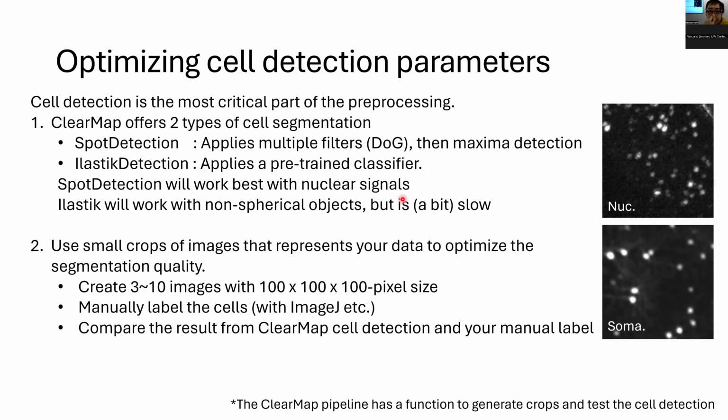So if anybody's looking to segment cells, or tracing or cells in general, spot detection for us in the Golden Lab was only useful for whole brain resolution data sets, imaging at like 2x, so like above 6 micron isotropic resolution. Anything higher than that in resolution, spot detection didn't work very well, so we had to stick to classification.